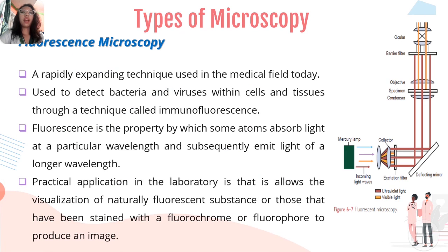Fluorescence microscopy is a rapidly expanding technique used in the medical field today to detect bacteria and viruses within cells and tissues through a technique called immunofluorescence. Fluorescence is the property by which some atoms absorb light at a particular wavelength and subsequently emit light of a longer wavelength. Its practical application in the laboratory allows the visualization of naturally fluorescent substances or those that have been stained with a fluorochrome or fluorophore to produce an image.